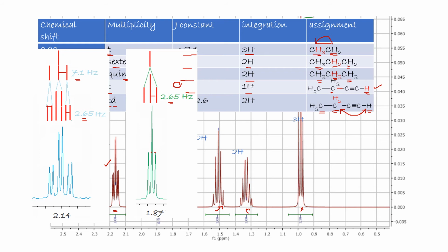We have C6H10. This makes C2H, so we have C6H10 minus C2H, leaving C4 residue with H9.